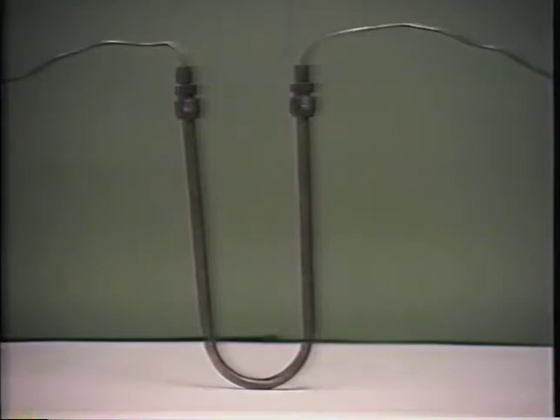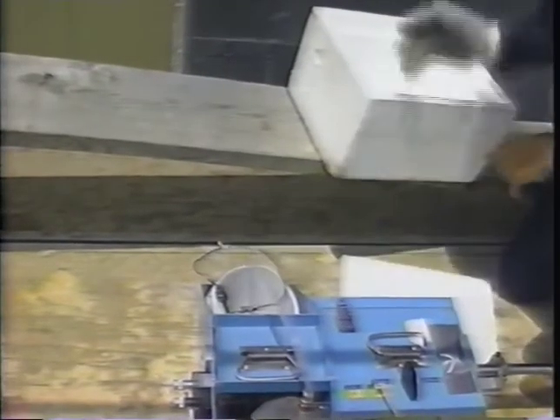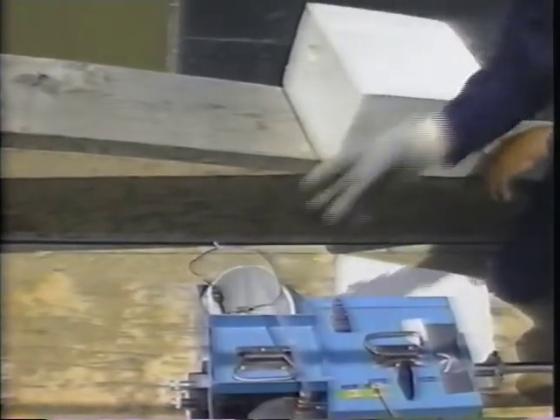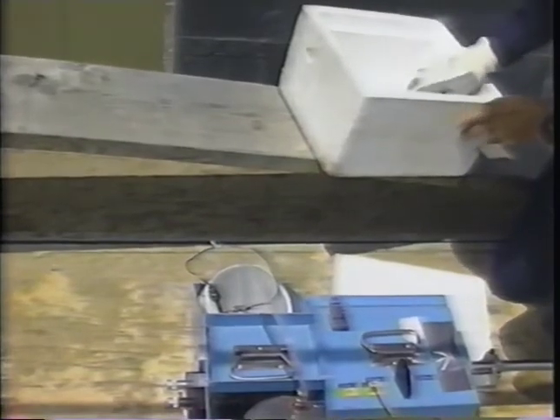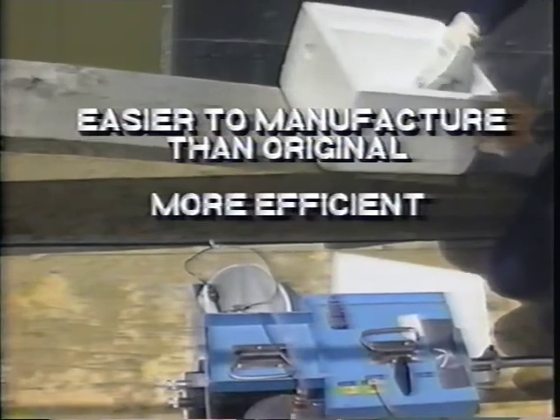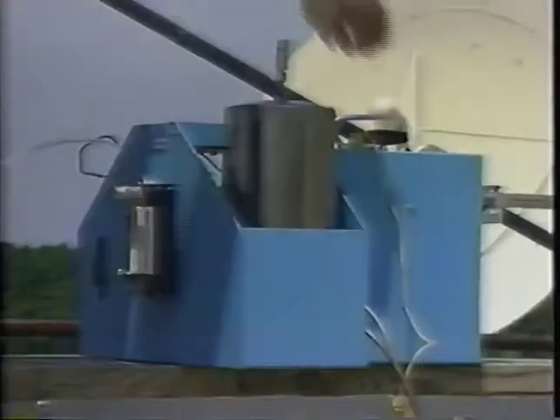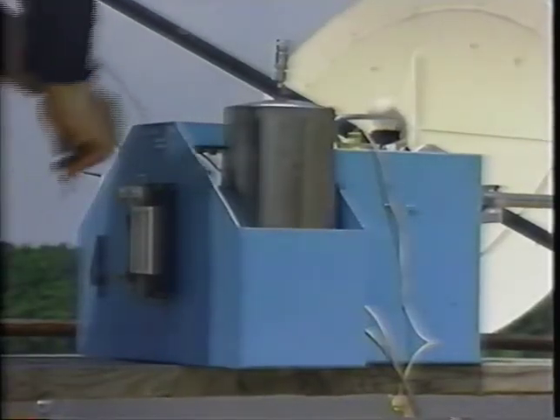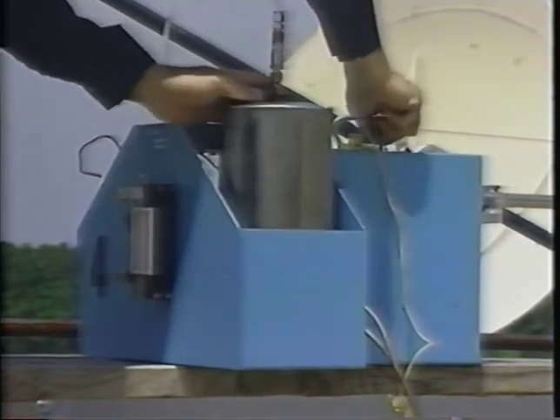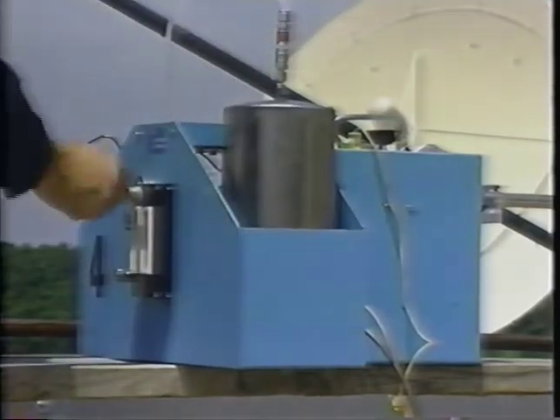The condensate trap, or cold trap, consists of 3/8-inch stainless steel tubing bent into a U shape, packed with quartz wool, and submerged in dry ice. This cold trap is also the result of the 1988 revisions to Method 25 and is easier to manufacture than the original and more efficient. The specification for the sample tank has not been changed. Either a stainless steel or an aluminum tank with a minimum volume of 4 liters is appropriate.